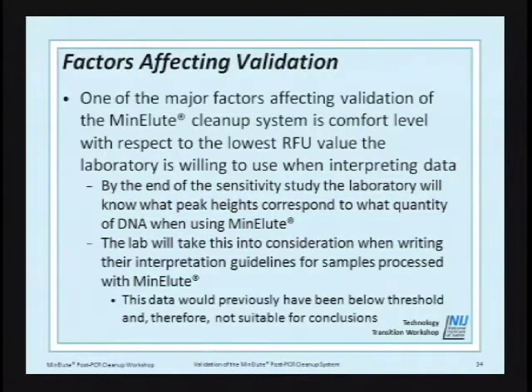One of the major factors affecting validation of the MinElute cleanup system is the comfort level with respect to the lowest RFU value the laboratory is willing to use when interpreting data. By the end of the sensitivity study, the laboratory will know what peak heights correspond to what quantity of DNA when using MinElute. The lab will take this into consideration when writing their interpretation guidelines for samples processed with MinElute. And this data would previously have been below threshold and therefore not suitable for conclusions.